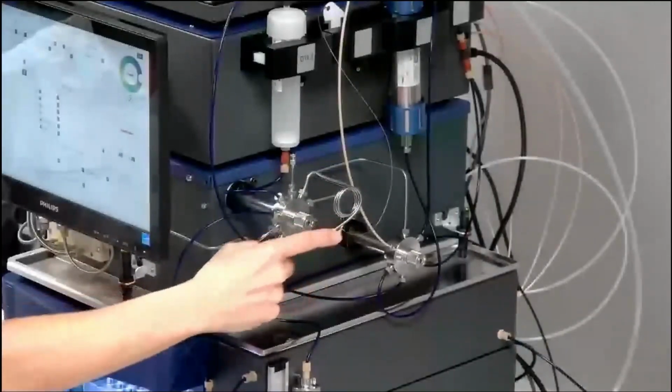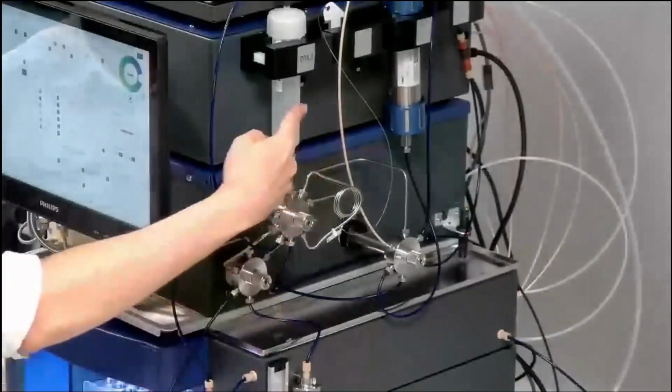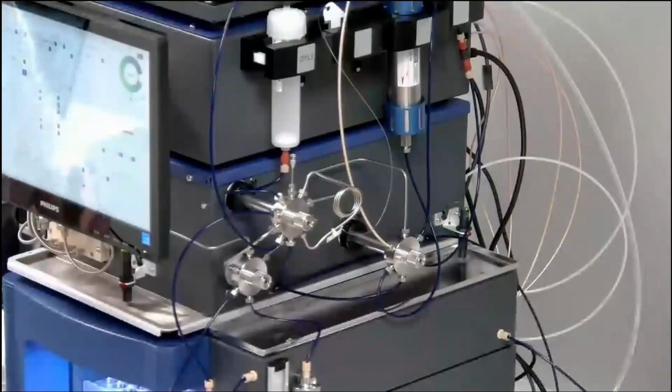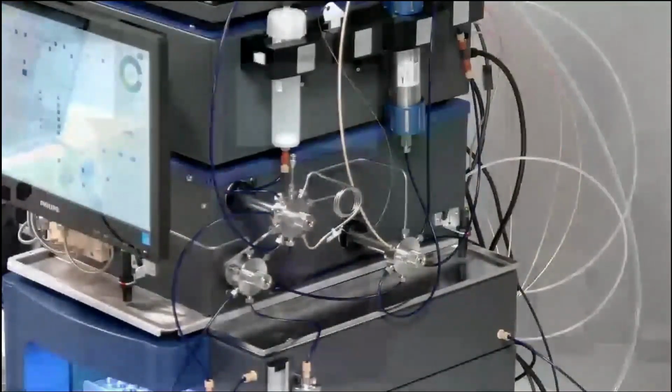So it's the way to inject liquid. Or you can also use dry load to make solid injection. All is managed by the software. So you have to choose to make the equilibration of the column, and after the equilibration, make the automatic injection of your sample inside the column.